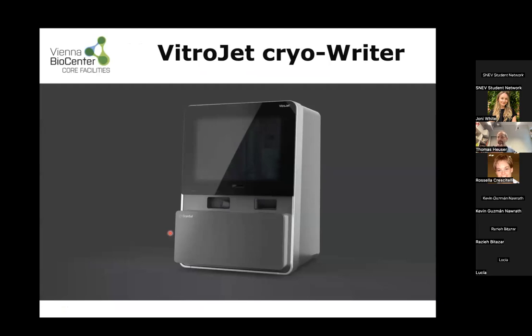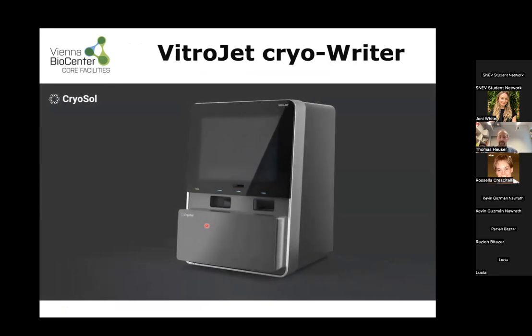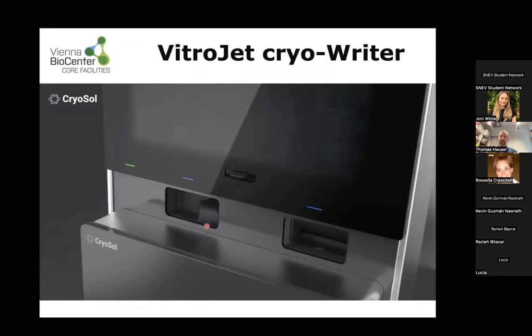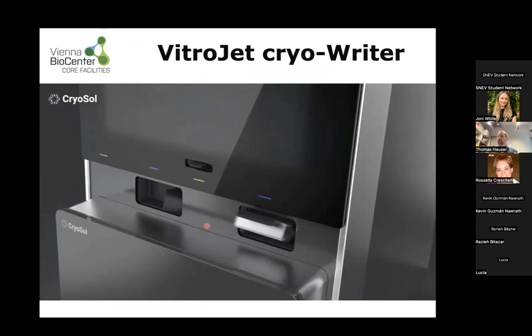I mentioned this plunge freezing method is highly ineffective. You lose more than 99% of your sample. And I quickly wanted to show you 2 other possibilities that we could use. This here is a commercial video by the producer of this instrument called Vitrojet. And this is the so-called cryo-writer.